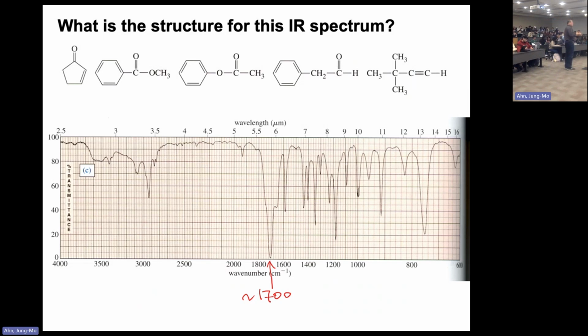That's the thing. So let's start looking at it. What this points out is that we have a carbonyl there, and this molecule has a carbonyl. Whatever the carbonyl is, it is there. So it cannot be this one, because that one doesn't have a carbonyl. It could be either this, that, or this. It's a full possibility. So we have to figure out what the carbonyl signal would be for each molecule and try to match it with this one. All right, the first example is a conjugated one. There's a carbonyl here, but a double bond is conjugated next to that.